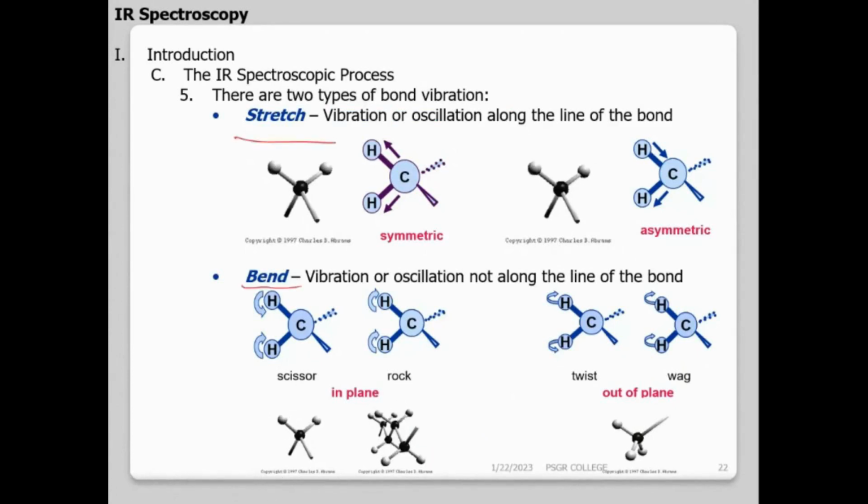Symmetric stretching: you can see in this animation both the bonds are simultaneously expanding, or simultaneously compressing. Whereas in asymmetric stretching, one elongates and the other compresses.